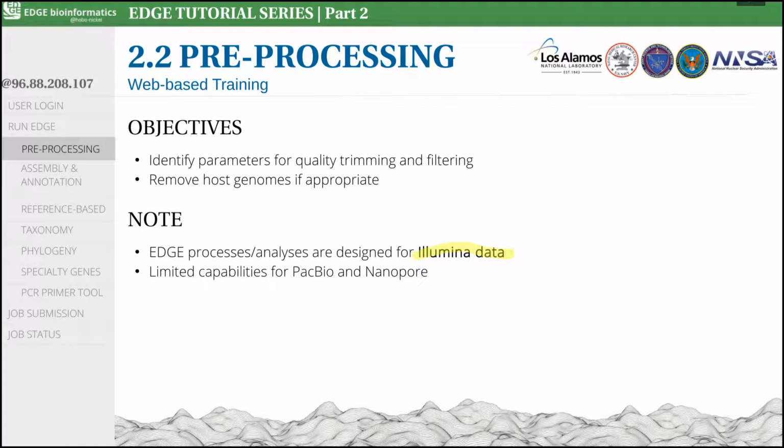As a final reminder, we are running two job submissions in parallel. The first uses the E. coli FASTQ files in the PublicData testData directory. The second uses data from the SRA run SRR2164314.